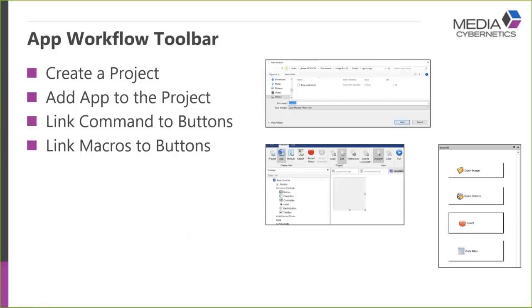Depending upon the level needed and the sophistication, sometimes it involves more advanced macro writing skills. But for a lot of things, people just need a simple interface without going through menus, and you can do that simply by putting together an app that either goes through the steps, or you can link macros to it, or some combination. And it's a very simple thing to do.